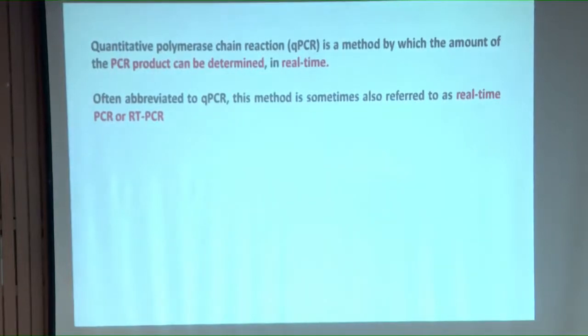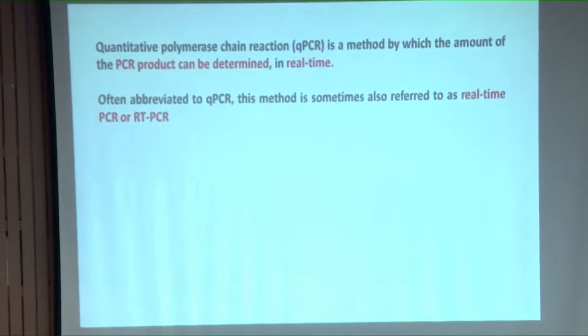So I was thinking about how the human brain really works. When the PCR was invented sometime in the early 80s, and even today, if you do PCR, you really do not know whether something is really happening or not, right? So what you do, you mix around 6 to 7 chemicals in a tube and put the tube in different temperature regimes, and you wait for maybe a couple of hours. Then after that, again you have to wait for another couple of hours, because you need to put them in a kind of matrix to see whether something is appearing or not, what are called amplicons.